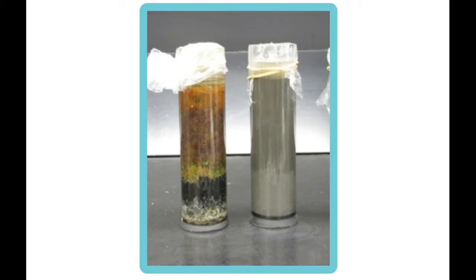So this is a picture of a typical and an atypical Winogradsky column. You can see that the column on the left has a variety of colors, each signifying a different microbial environment, while the one on the right is just dark, showing barely any sign of diversity. This is probably due to a lack of necessary nutrients in the column, thus stressing the importance of ensuring that there are adequate nutrient sources mixed into your sediment in the mixing bowl before pouring it into the column.